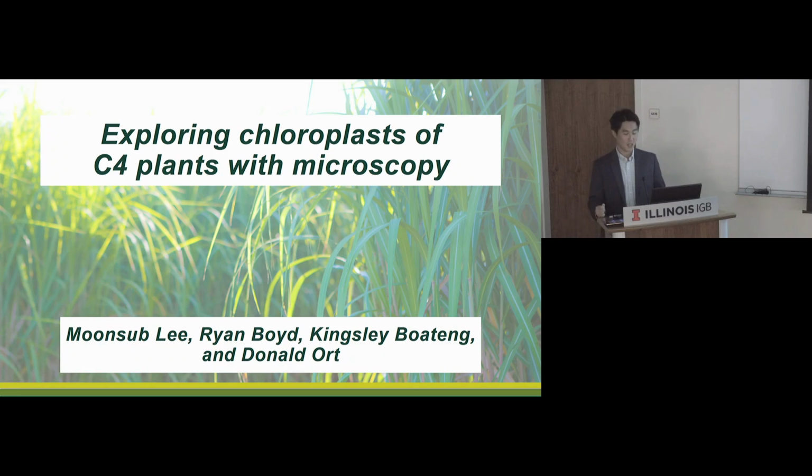I'm a postdoc working in Professor Donald Ort's research group at the University of Illinois. Today I'm going to talk about one of my research projects, specifically the C4 plants' chloroplasts using the SBF SEM and LSM microscope. Hopefully after this seminar, it might be helpful for your research or for selecting a microscope.